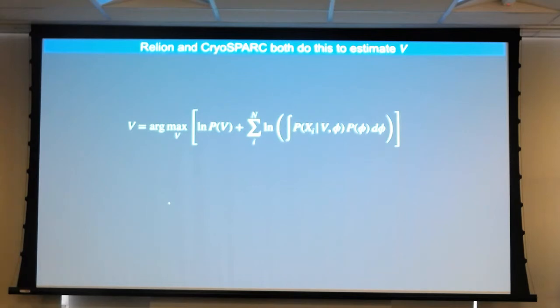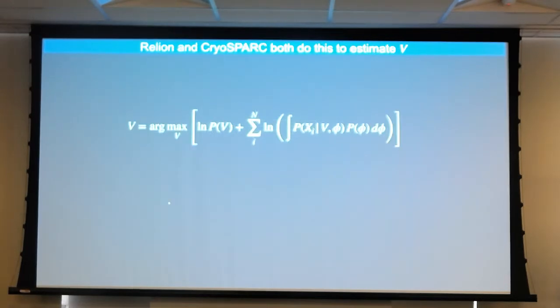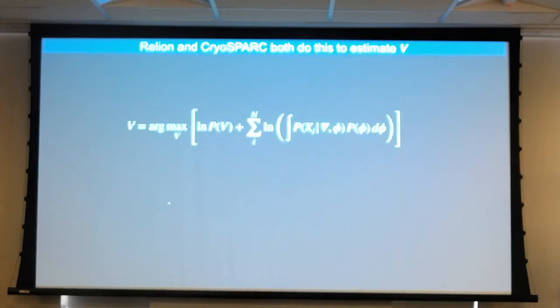When I show you the RELION formula, and I don't tell you anything, this is a hard problem. So what do we remember? What we have to do is to compute this thing.